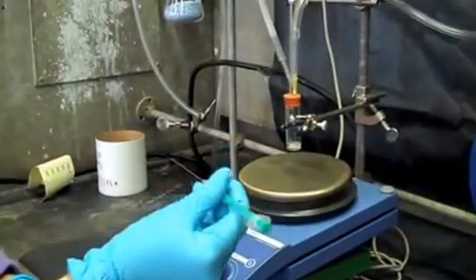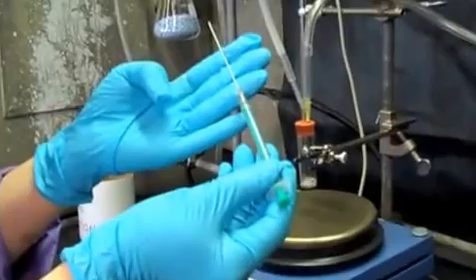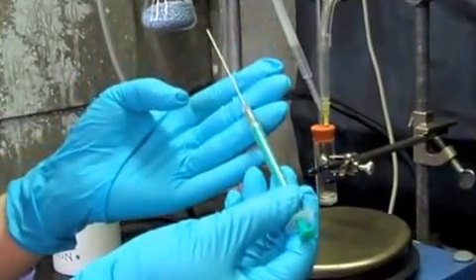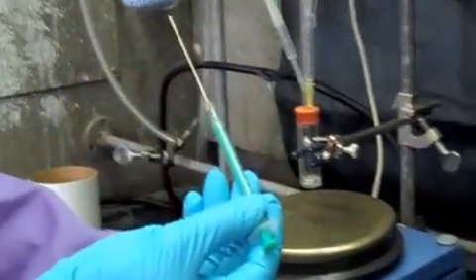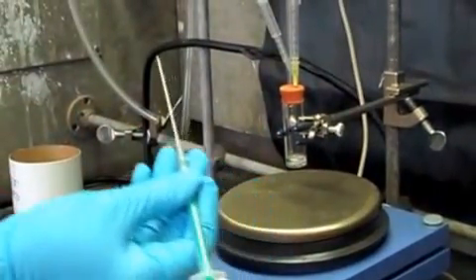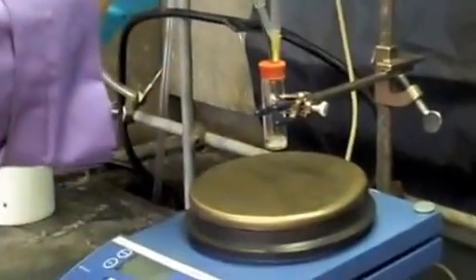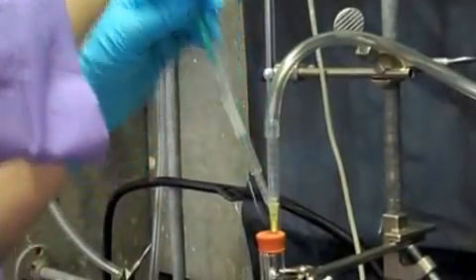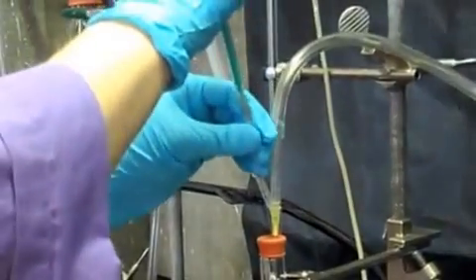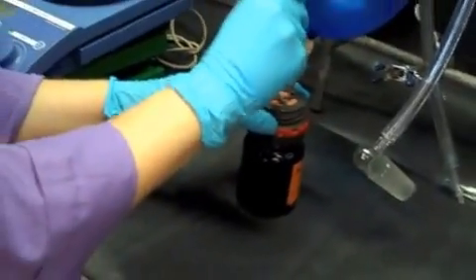I've acquired a needle to get the n-butyllithium. I'm using a 1 ml syringe, and I'm using a 3-inch black needle. Note that we still need to use black because we're going through the septum, and black is always 22 gauge. I need to purge my needle, however I would never purge it in the good bottle of reagent. That could destroy the SureSeal. Therefore I'll use my reaction and draw up a small amount of nitrogen and just let it out into the air. I'll repeat this process 3 times and quickly pierce my bottle of n-butyllithium.